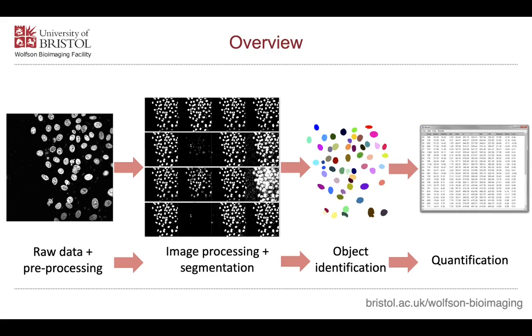So these example images here are the actual data you'll be using, and hopefully you'll go from a 3D data set acquired on one of our confocals in the facility through each step by step, building it all the way up to automatically identify each of these cell nuclei, and then measure the area and various other parameters of each of those nuclei individually and automatically.